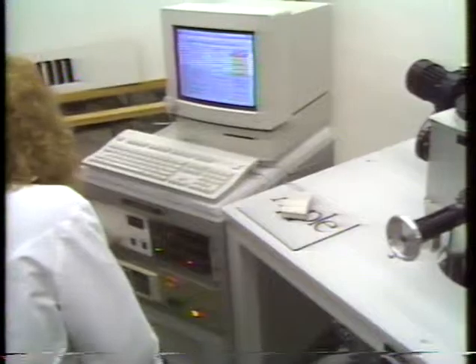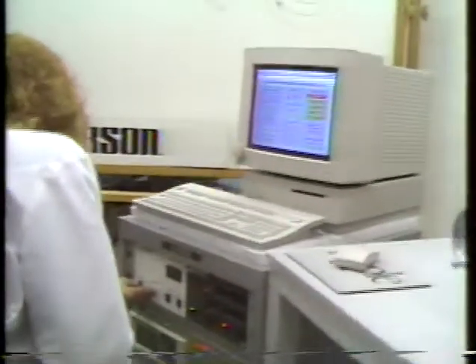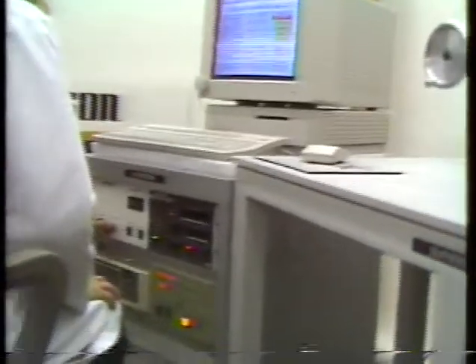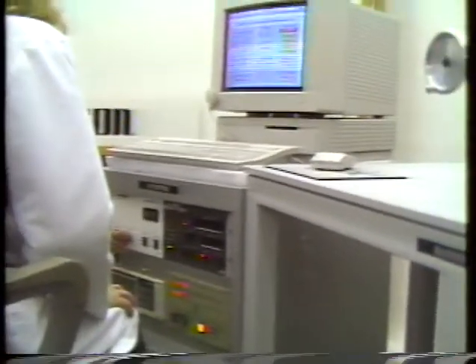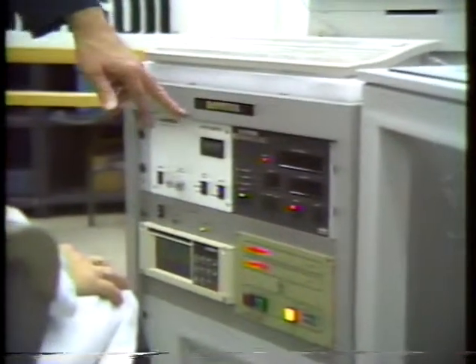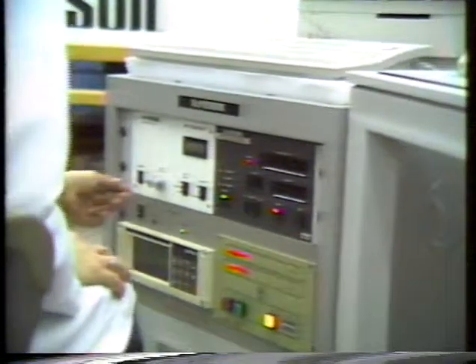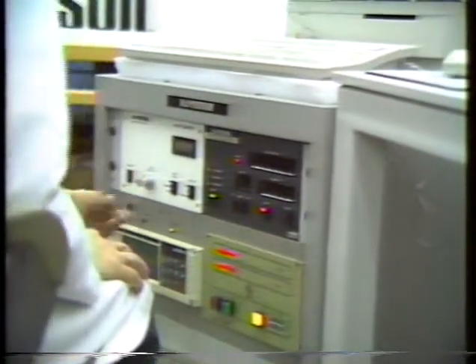When you had the shutter closed, you had just a minimal signal on the photometer, which was basically the dark level, and now you have turned up the high voltage to give us a signal level, right? Right. Lock it in there.